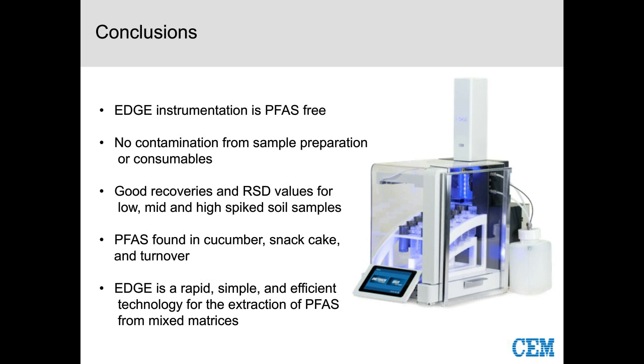However, if we considered concentrating that sample size down and running some sort of supported liquid extraction, or running a smaller sample size, we could indeed run those liquid samples, those water samples, on the EDGE. And as we open up that realm of liquid samples, we could do dairy. Milk is a very hot topic right now.